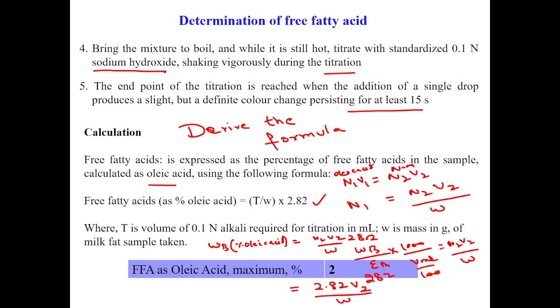The titre value you get, you put in the formula, and you will have the free fatty acid content, and as per FSSAI it is a maximum of 2%. Okay, so this way we are determining the free fatty acid content of any fat sample, oil sample, or ghee.